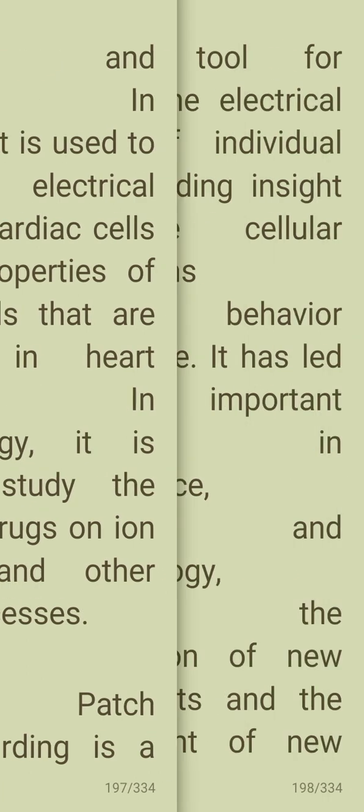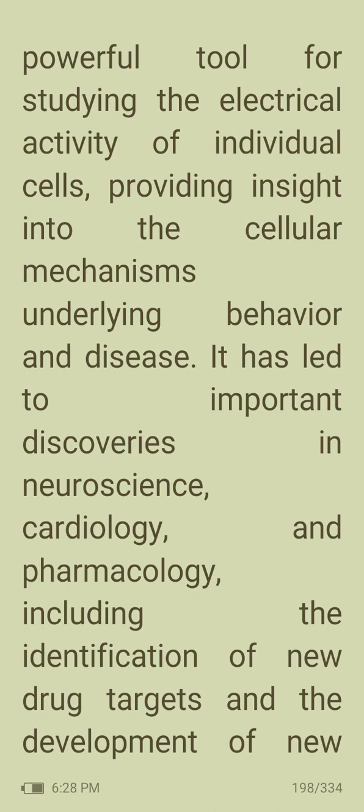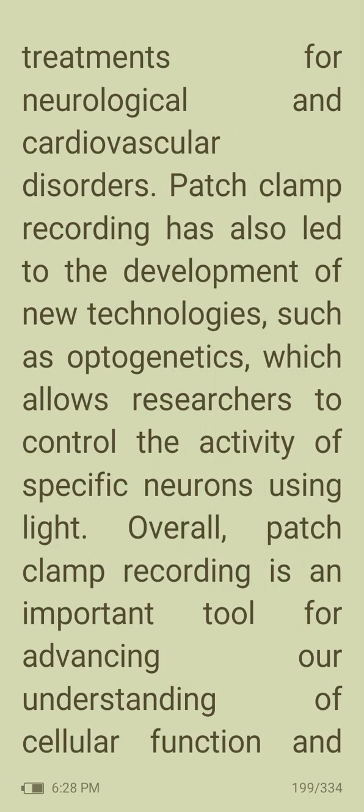Patch clamp recording is a powerful tool for studying the electrical activity of individual cells, providing insight into the cellular mechanisms underlying behavior and disease, which we will be learning. It has led to important discoveries in neuroscience, cardiology, and pharmacology, including the identification of new drug targets and the development of new treatments for neurological and cardiovascular disorders.